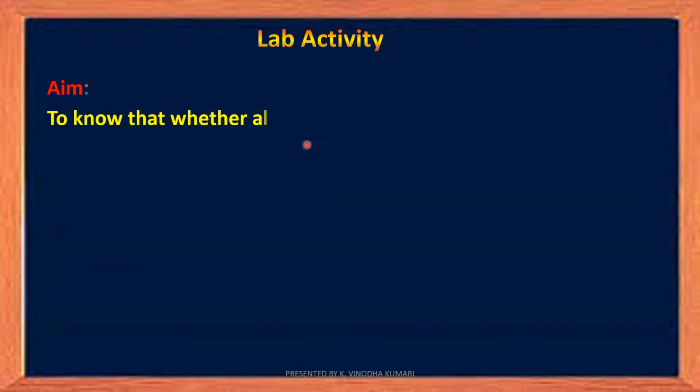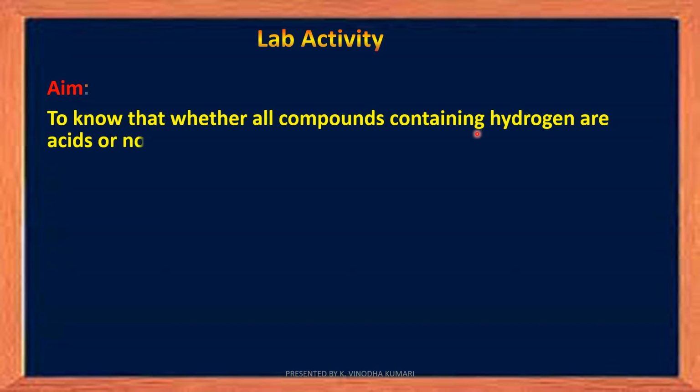The aim of this activity is to know whether all compounds containing hydrogen are acids or not. So now we'll perform an activity and come to a conclusion whether the compounds containing hydrogen can be considered as acids or not.